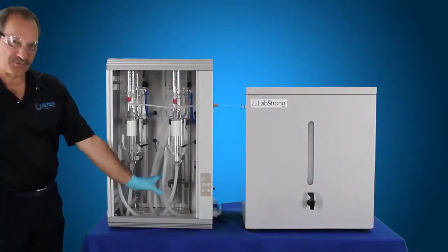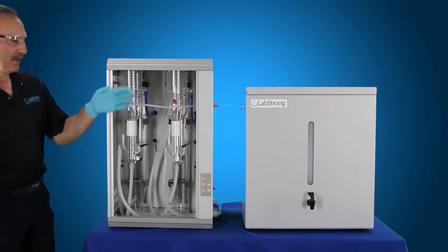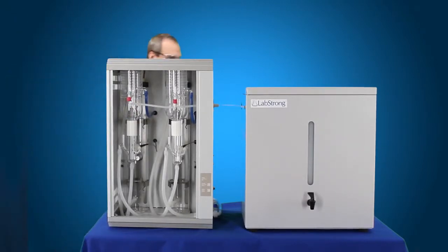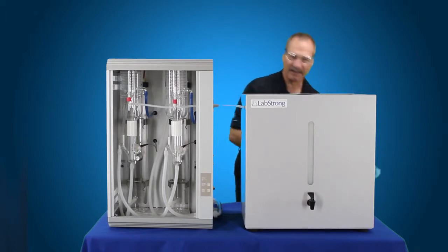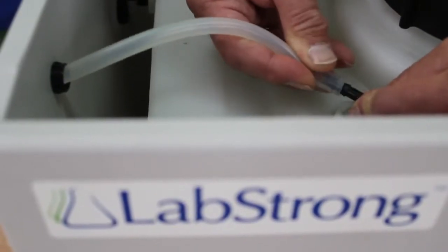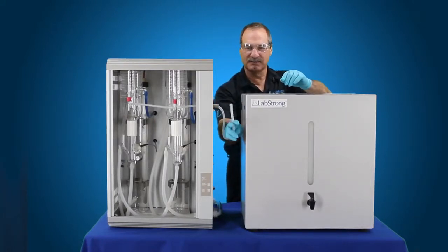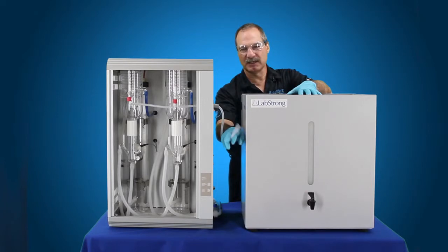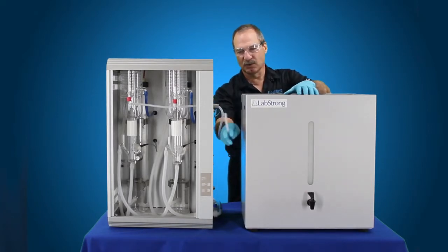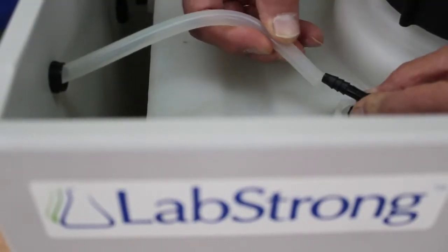Now that we've actually gone through the two flushes, we're going to go ahead and start the still back up. Before we do that, we need to go ahead and disconnect our distillate tube, pull the cover off the tank, and disconnect our distillate tube to the tank. Then we want to run this to drain — about 10 to 20 liters of water run to drain. So your first 10 to 20 liters that you're going to be running this unit, you want it to drain. You don't want to run that back into the tank. Once you've completed that, you can connect this back up to your tank.